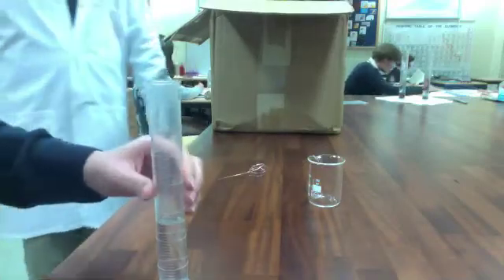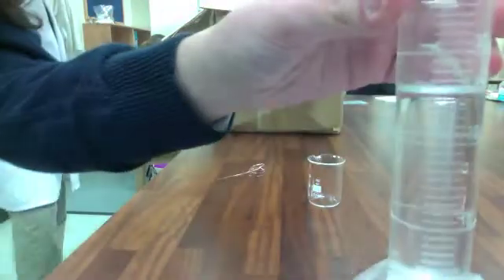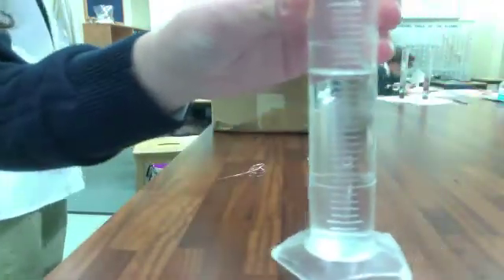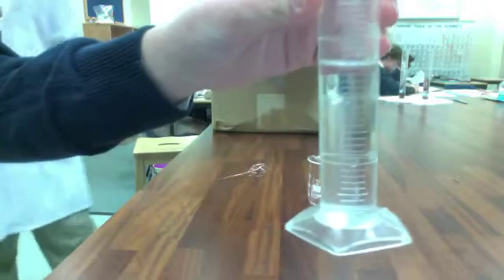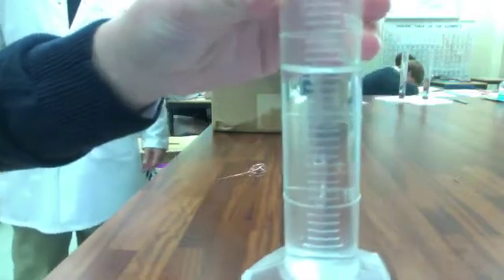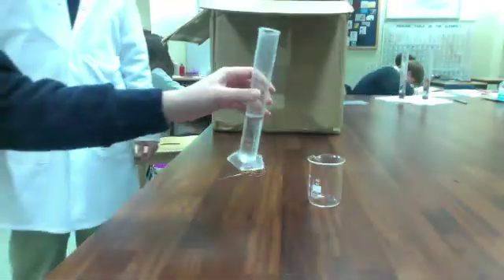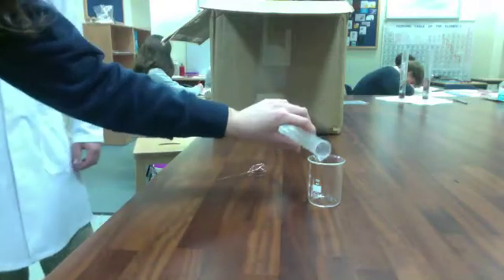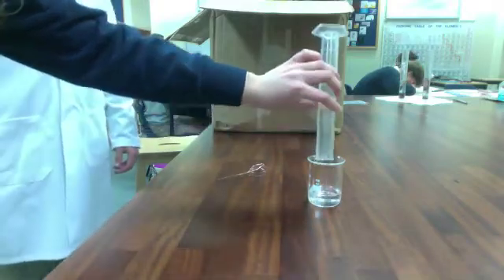All right, so what we have here is a solution of silver nitrate that we've carefully measured, and the volume is 25.8 milliliters. We're going to put that into a clean 100 milliliter beaker, pouring it all in.